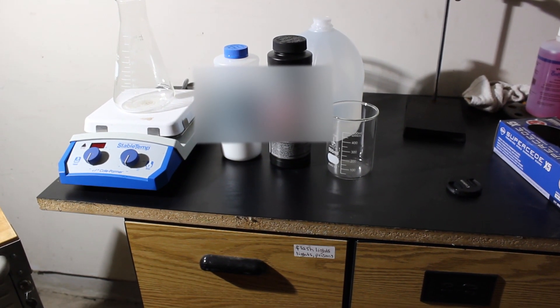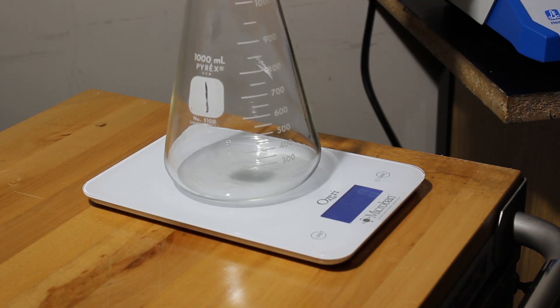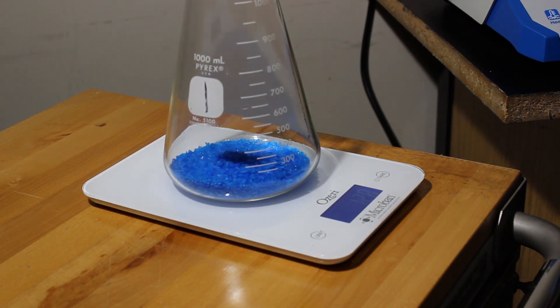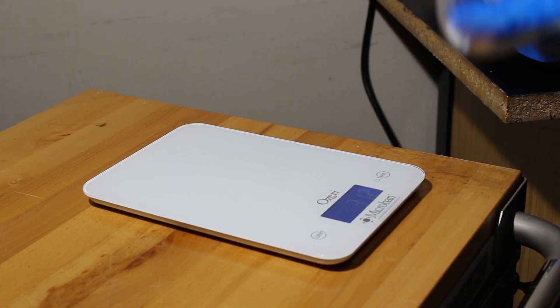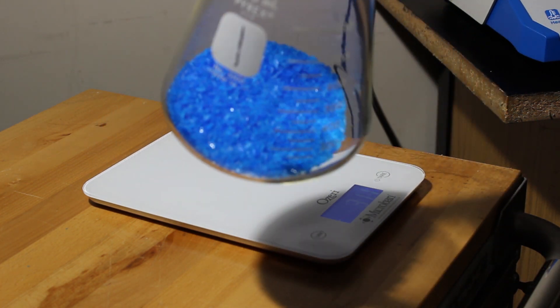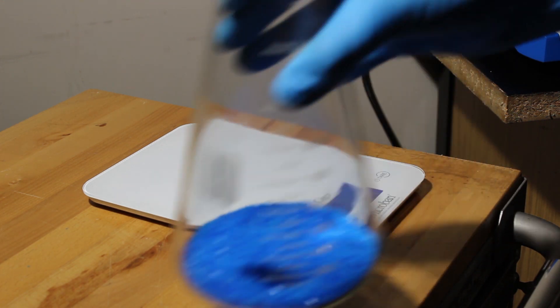We're taking this mass here and diluting it in about 350 mL of distilled water, then mixing it up on the hot plate to get it all dissolved.